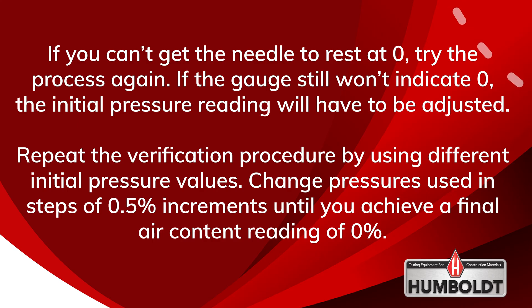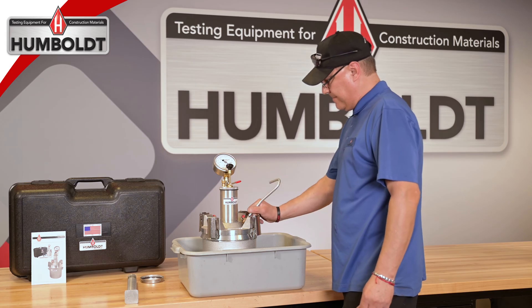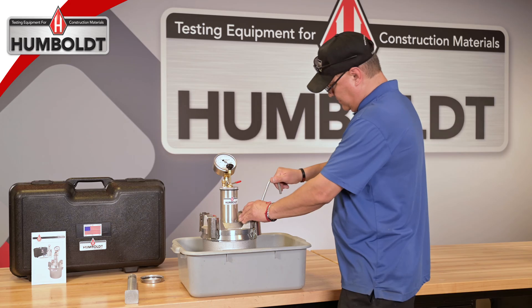Once the initial pressure reading has been verified, take the curved calibration tube and screw it into the top of the same pet cock that has the short tube screwed into it on the inside of the meter. Make sure the curved calibration tube is facing down.